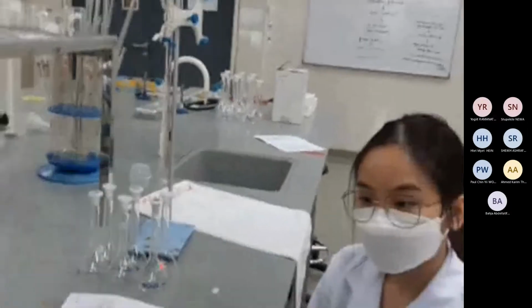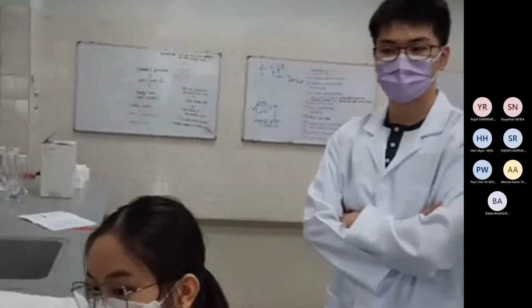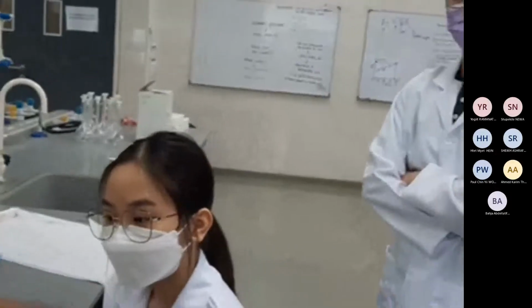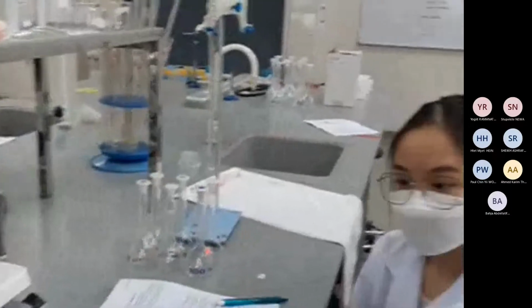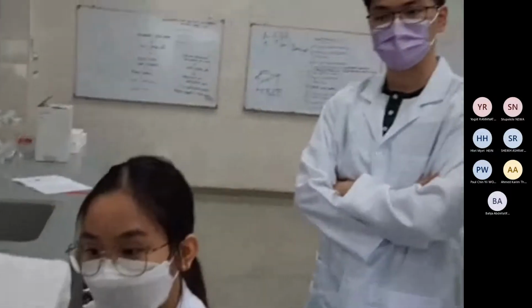Lift it up, take the water out and put it on one side. Take your sample in the other cuvette. Of course, rinse it and wipe it, put it there, and cover it. That's it. It will give you the absorbance result here. You don't need to touch anything. Understand what I said? First, you set 535 here, and then put the blank, that is water. Press 0. Take it out, put it aside, put your sample here, and there is no need to press anything. It will directly give you the result.